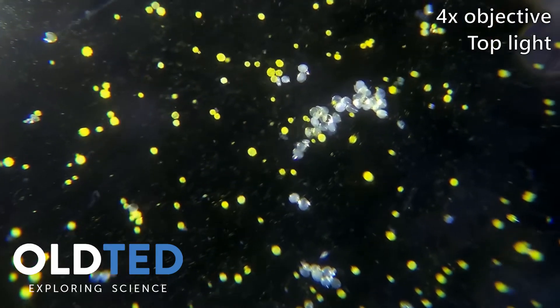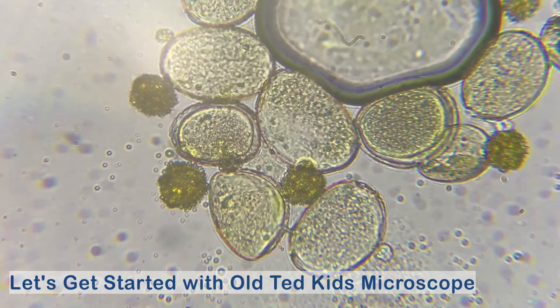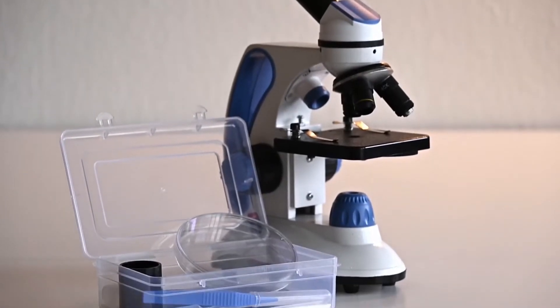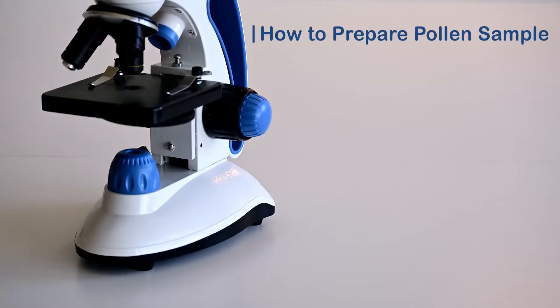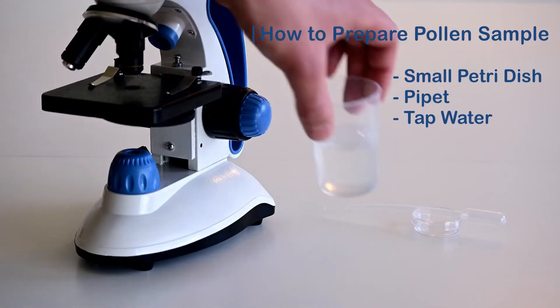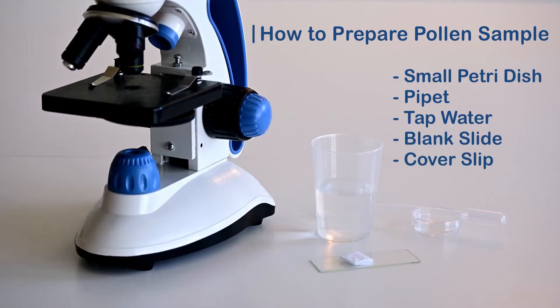Pollen grains are incredibly tiny structures produced by flowers in order for the plant to reproduce. Today I'm going to show you how to find and observe them using the old Ted Kitts microscope and the included lab kit. The things we'll be using are the small petri dish and pipette from the lab kit, some tap water, and a blank slide and cover slip, which also comes with the microscope.